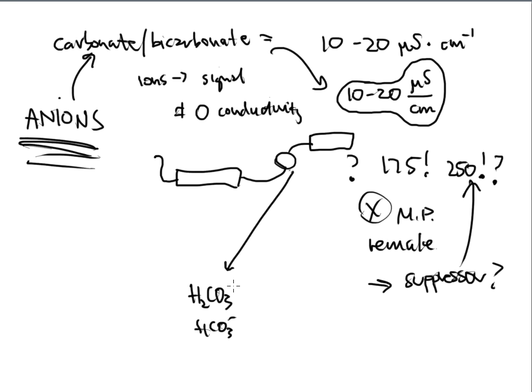So a little bit of H plus, a little bit of HCO3 minus, a little bit of H2CO3, but that slight negative HCO3 is the culprit, and that's what begins to do it. The acetic acid addition: sometimes we add acetic acid to the mobile phase mix, and acetic acid combining with carbonate bicarbonate is not a big deal.